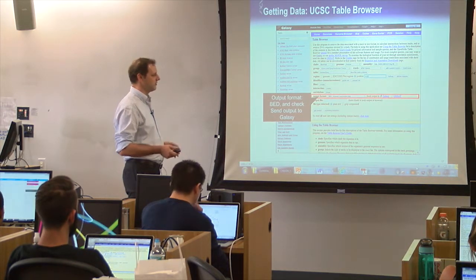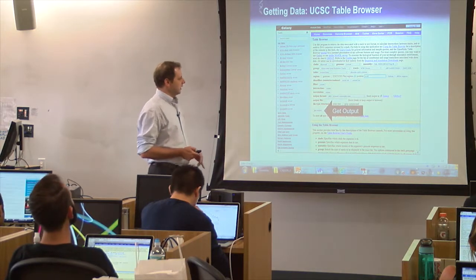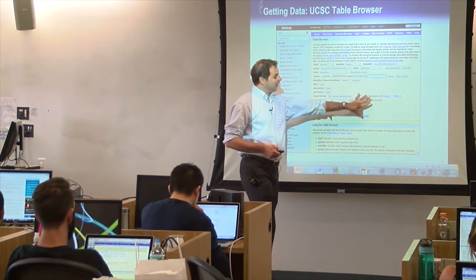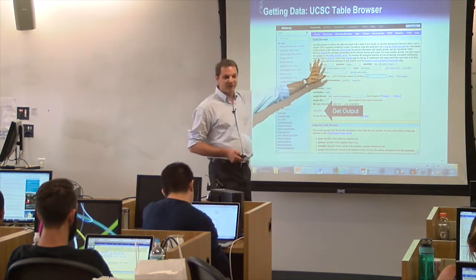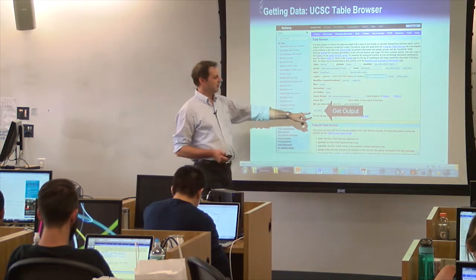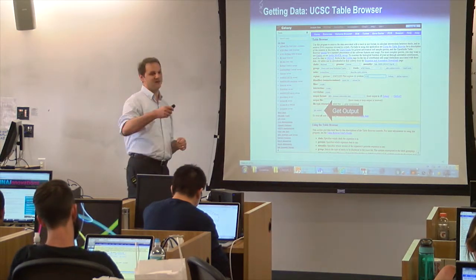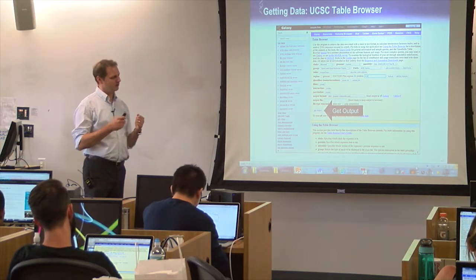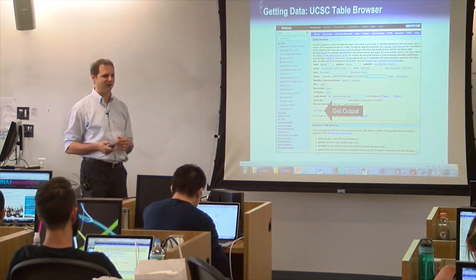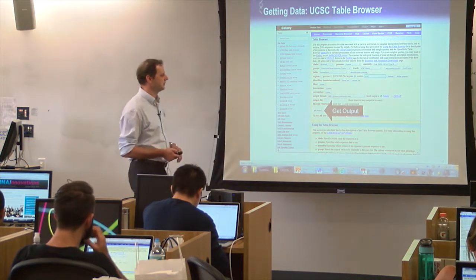It depends on the track type. Just kind of takes experience to know what works well. And when you do this from Galaxy, this tick mark here is usually already there. If you're actually working in UCSC Genome Browser independently, so you have a different browser window open, I believe that is also there too. So you can tick that in the UCSC Genome Browser and then import it into Galaxy. I'm not exactly sure on the preferences if it uses the same browser or uses the current login or something. I don't remember. But usually it's better just to access it directly through Galaxy.